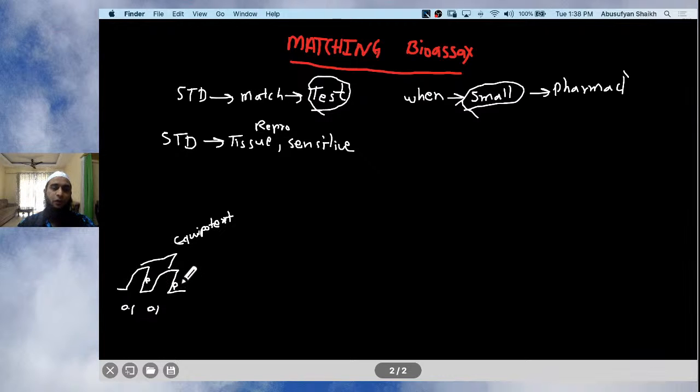Now as a process, we need to give different doses of the standard. So we'll give the next dose, suppose 0.2 ml. Now what happened as compared to our earlier response? You can see the height of the response has increased because you have increased the dose. Now you can keep on giving the dose of the drug. Next you give 0.4 ml, which is double the earlier dose. Again you can see there is an increase in the height. So as you increase the dose, there is an increase in the height of the response. That is seen in this type of bioassay.